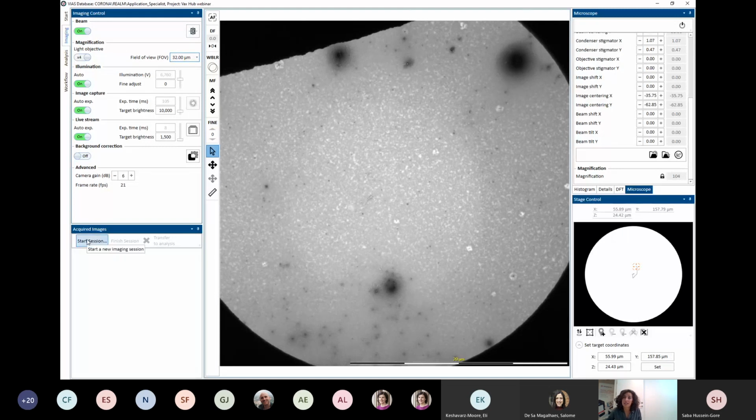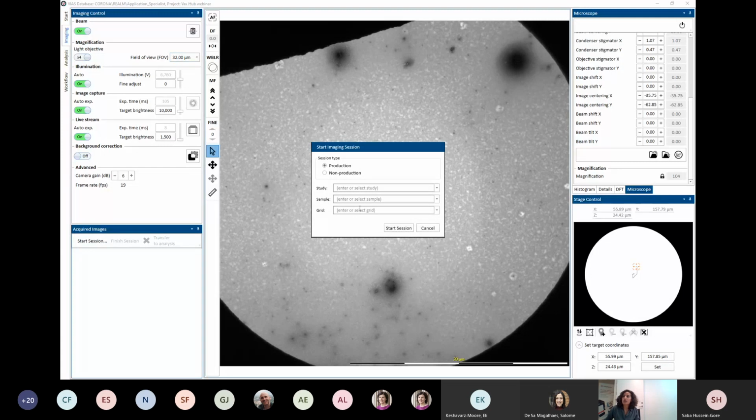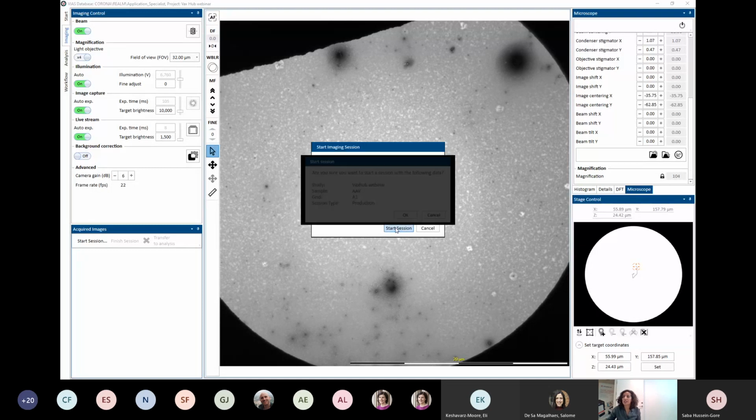So I will click Start Session here, and you can choose what session type you want, whether it's for production or non-production. The only difference is if you click production, you have to enter the information here, which says study, sample, and grid. So let's do that. Let's say this is production. So our study, we can say this is for the VaxHub webinar. And our sample is AAV. And the grid, so you can give it the grid position. So you can use the grid name here. So the grid here was grid A1. And then I click Start Session.